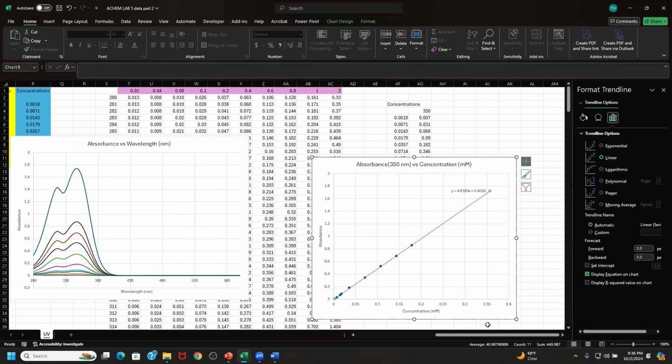Okay, so you can compare the concentration values that you are getting for your unknown sample using the UV visible dataset and the fluorescence dataset, and see what you can propose. You can include anything in your discussion. If there are any deviations, what is the reason that deviations may have occurred? You can include anything that you think caused differences in the unknown concentration measured using the UV visible method and the fluorescence method.